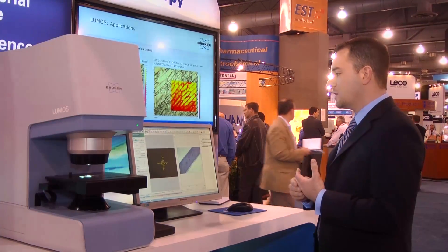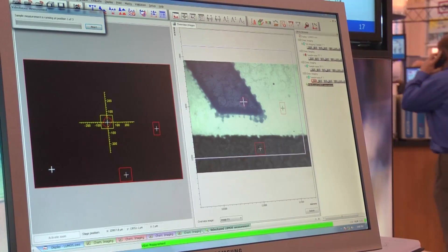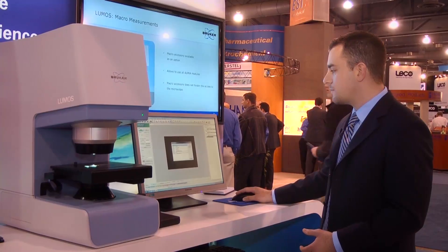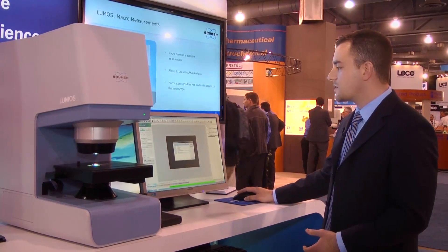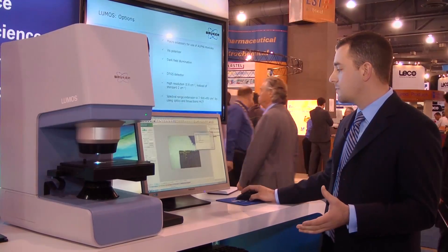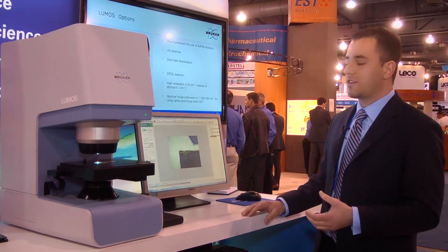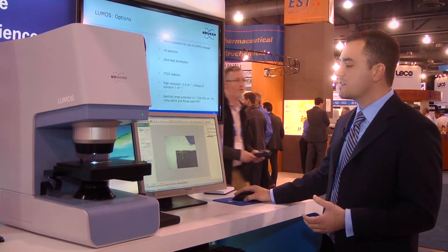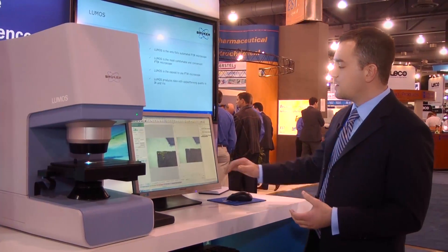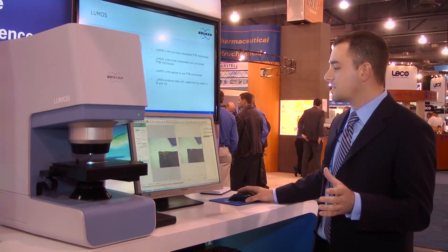Looking at our screen, we're able to simply click on a spot and move to that spot with our automated X, Y, and Z stage. Here I've moved to my Bruker sticker. I can take a single snapshot using the nice high-resolution 5-megapixel digital camera.